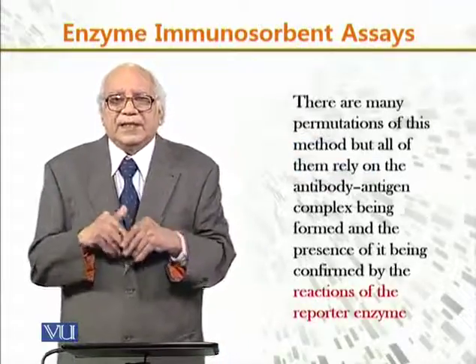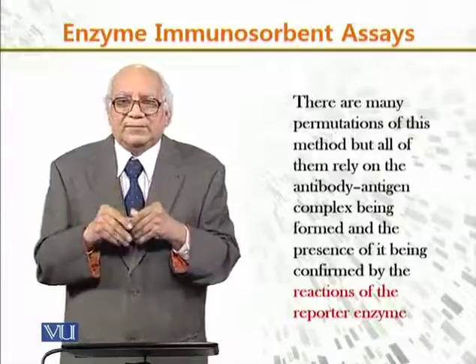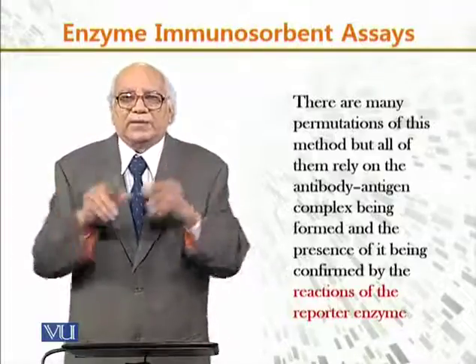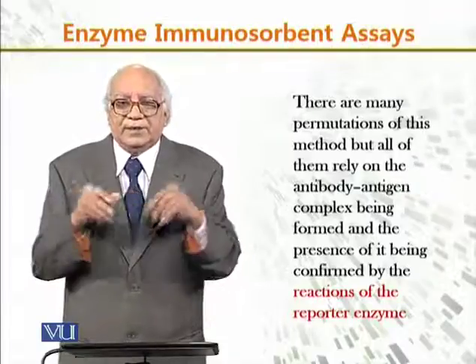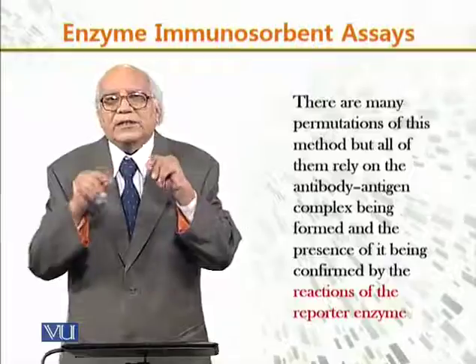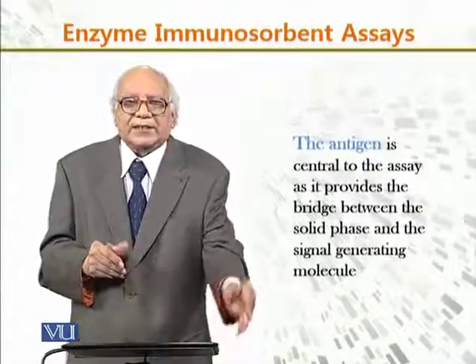There are many permutations of this method, but all of them rely on the antibody-antigen complex being formed and its presence being confirmed by the reaction of the reporter enzyme. The reporter enzyme is an important component of this reaction.